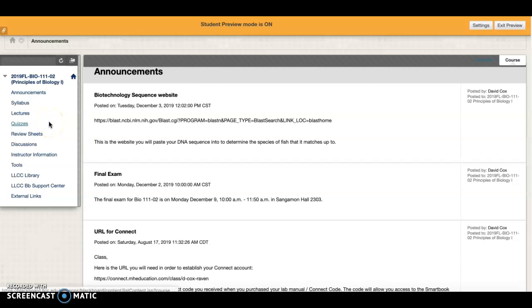All right, guys, so here is the little video on how to access your DNA information to figure out what is the actual species of fish that you guys took the DNA from. So I'm going to walk you through the steps here. The links are there and all the information is sitting in your Blackboard shell.